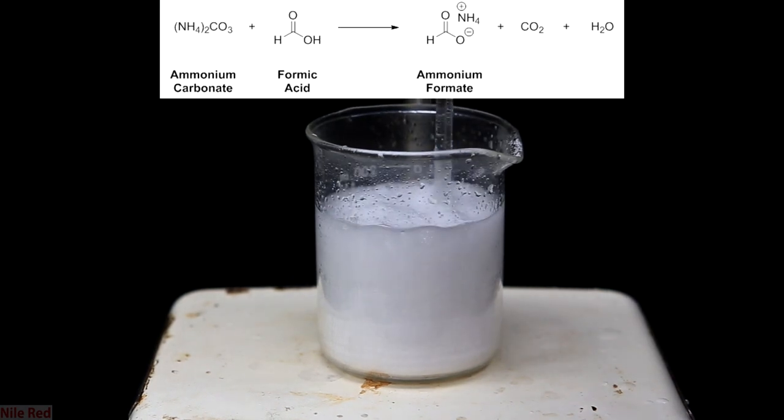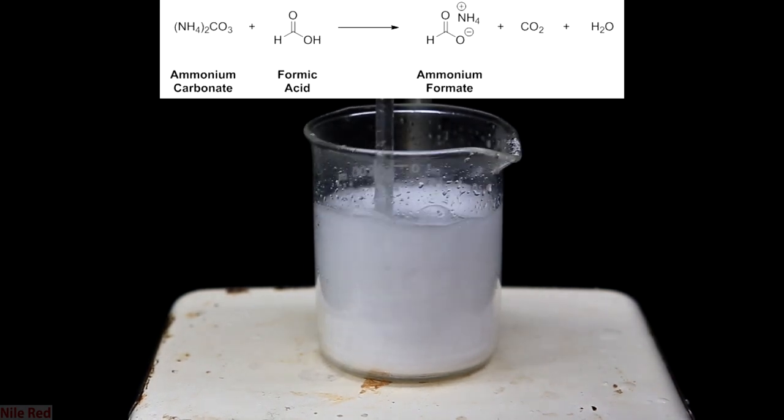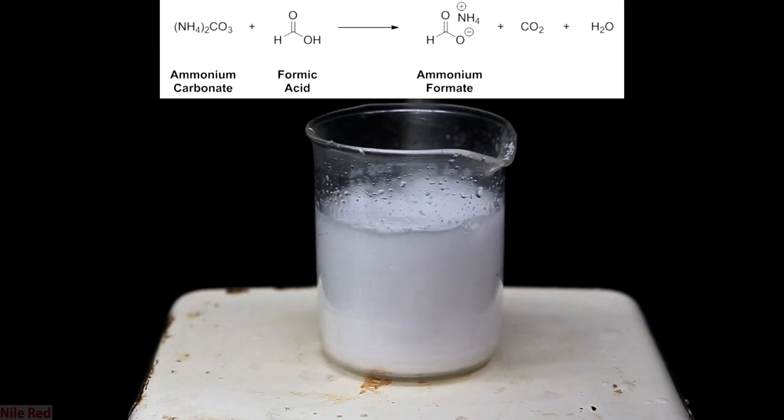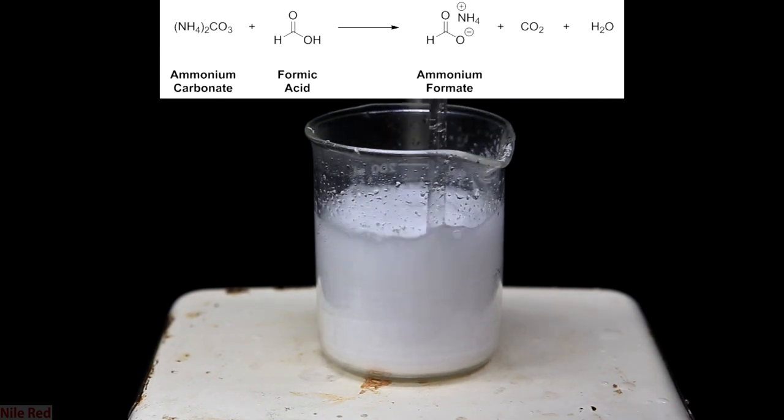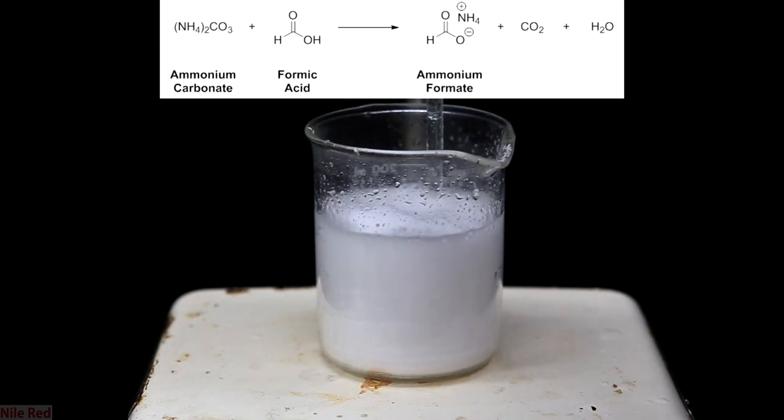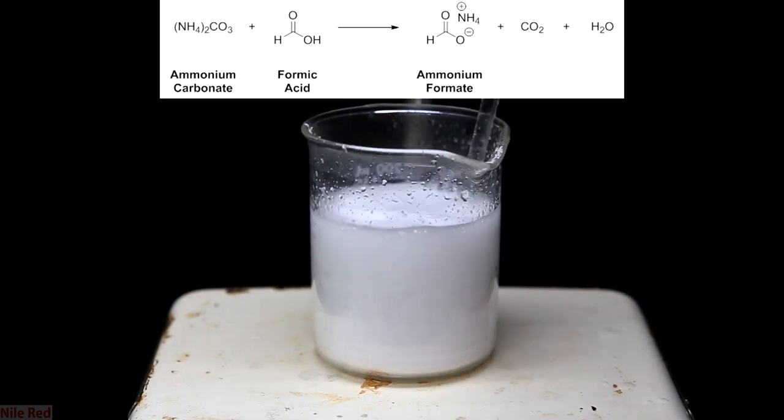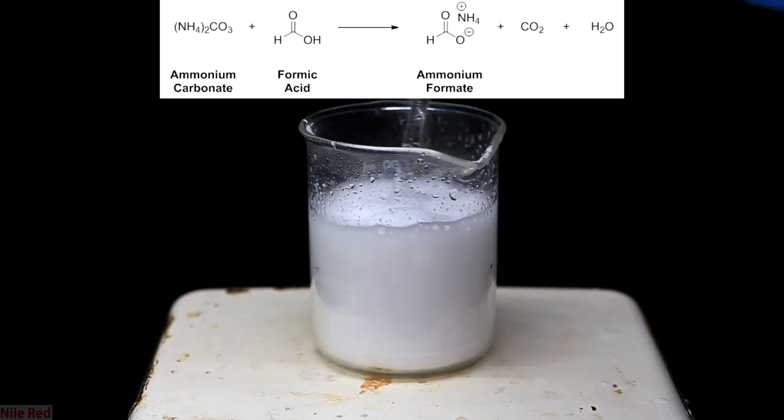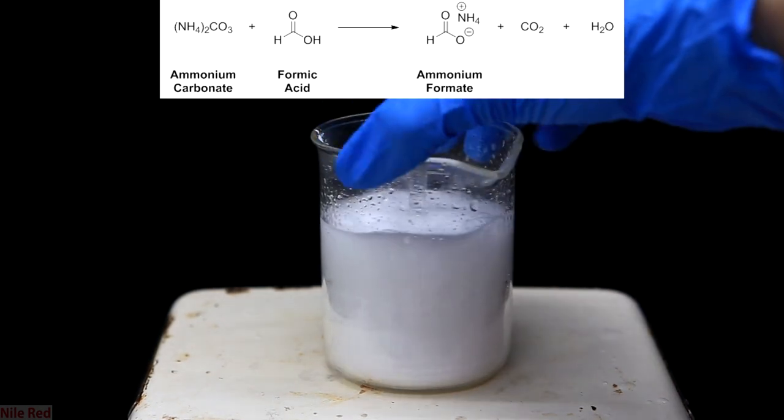What we're doing here is a neutralization reaction where ammonium carbonate is reacting with formic acid to produce ammonium formate, CO2, and water. The ammonium formate, when it's produced, dissolves into the water because it's extremely soluble, but the CO2 escapes as a gas.